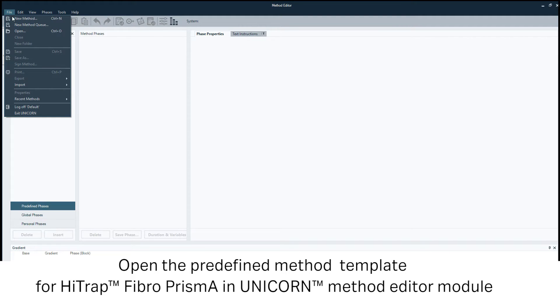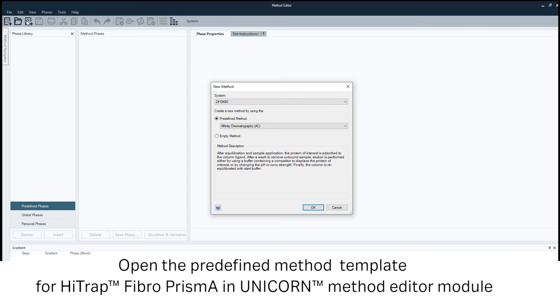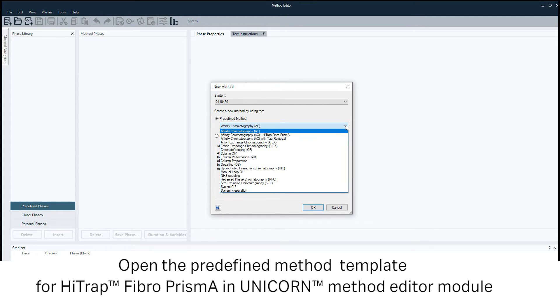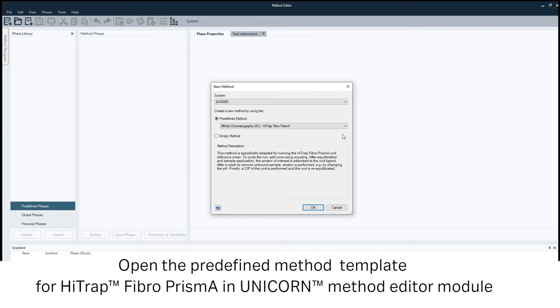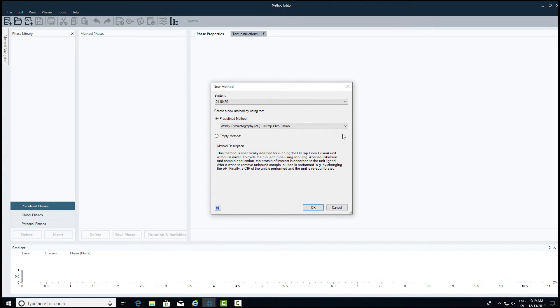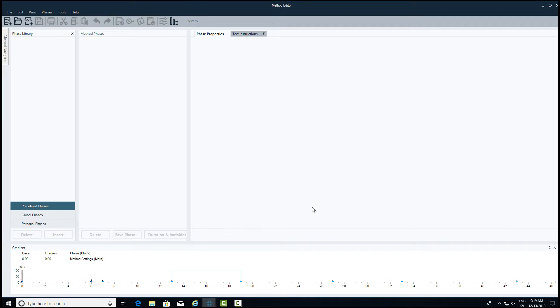Make sure that you have the latest version of the instrument configuration available on the ÄKTA system web page. The predefined method for the HiTrap Fibro PrismA unit is available in the latest released instrument configurations for ÄKTA Pure and ÄKTA Avant. The instrument configurations are available for download on the ÄKTA systems home page.